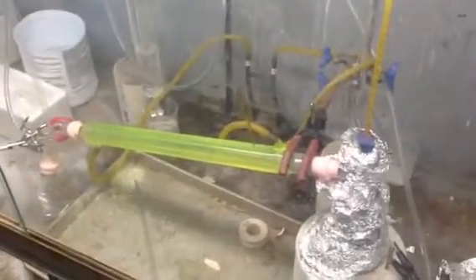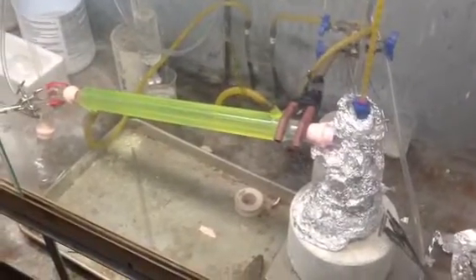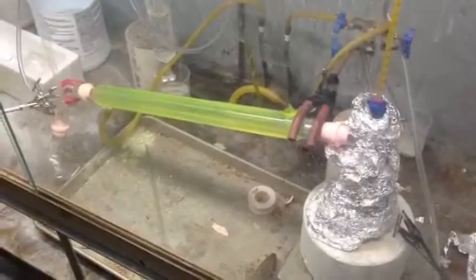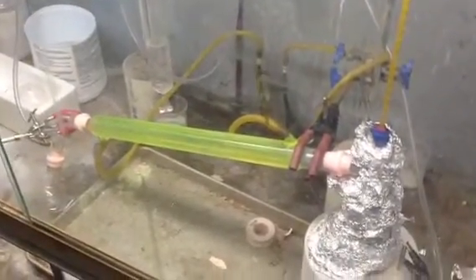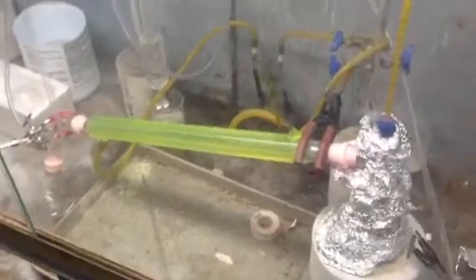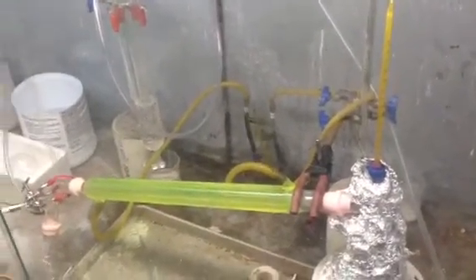Hello YouTube, just doing a real quick video here. I am distilling mercury for a friend of mine that owns a neon sign shop. He had a whole bunch of dirty mercury and he was wondering if I could distill it for him so that he can use it in his lamps, hopefully.